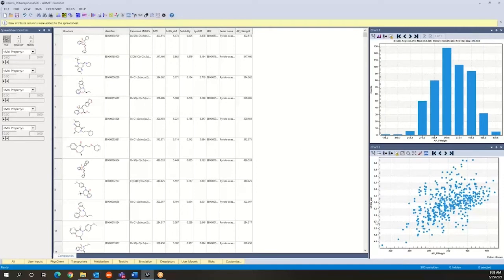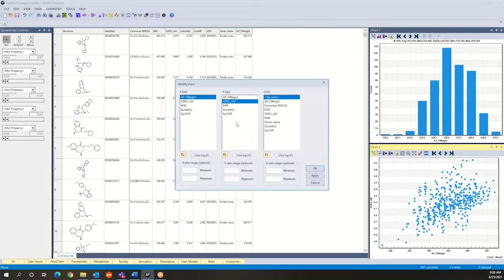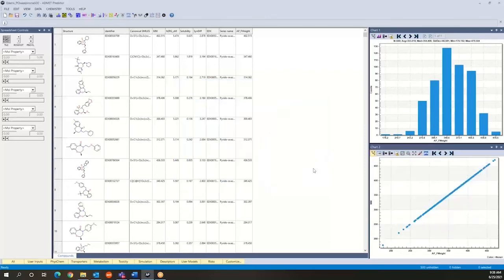Now how would we know that this is actually correct? So I have two molecular weight columns actually here and you can see that they match and if you want to plot them that's just very easy to do. You take one and then the other and you will see that they are on a straight line. So for sure we've done the right thing and it's worked correctly. It's just a very easy check to do.